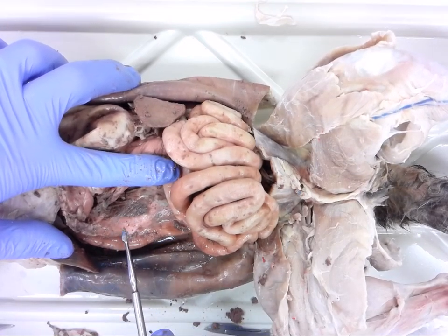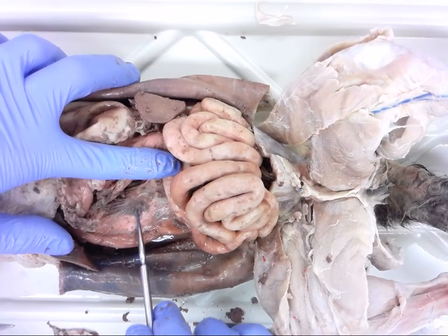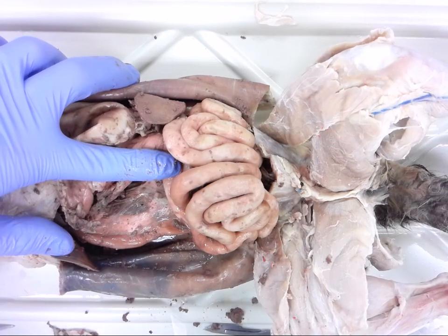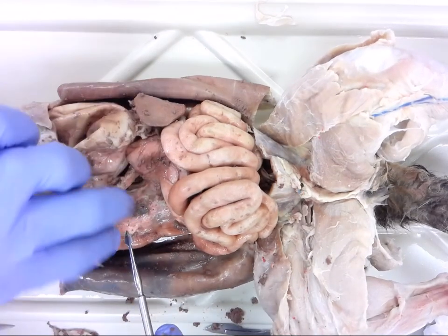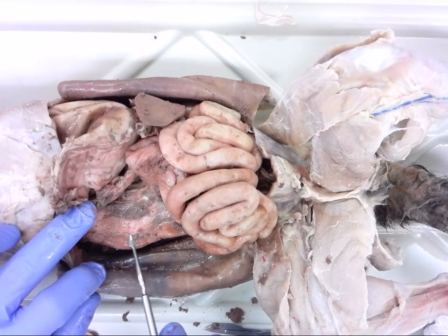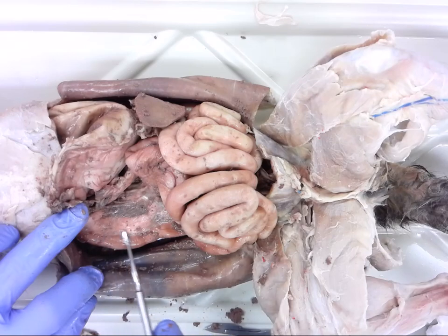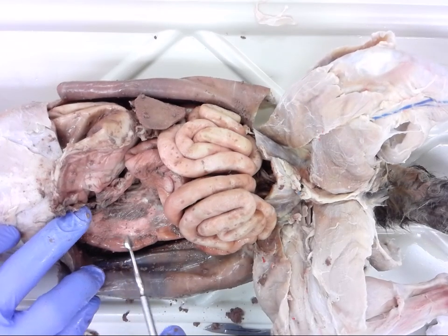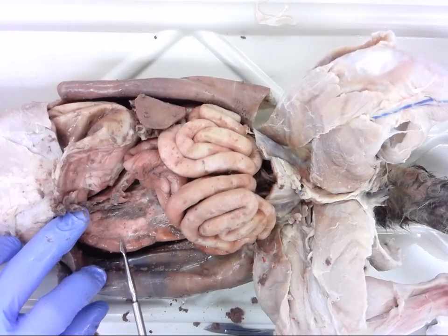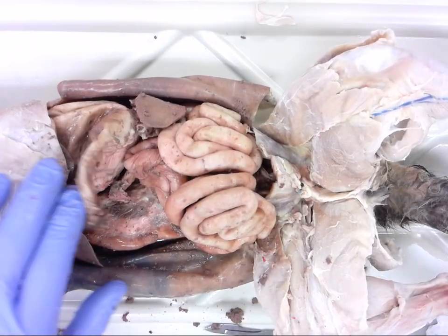Most of them are a kind of yellowish color, and it's somewhat hard to identify because it is encased within a membrane. It kind of looks like fat tissue or something else, but it is a spongy looking tissue that runs right along this first part of the small intestine. If you're having trouble finding it, feel free to visit other specimens and take a look, but it does run along the inside there of the small intestine.